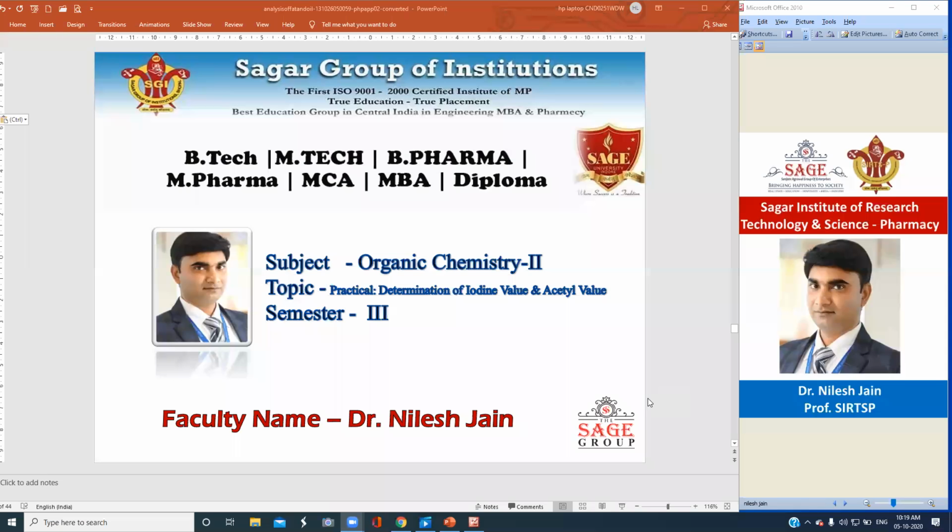Good morning, students. Today we continue our class with the practical demonstration of determination of iodine value and acetyl value. As we already discussed in theory, what is the iodine value and what is the principle behind the iodine value?